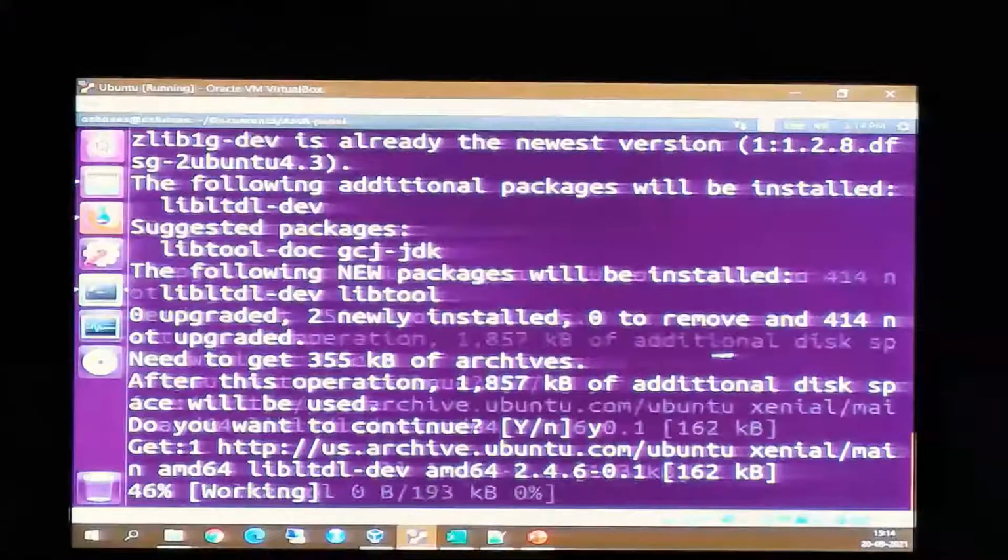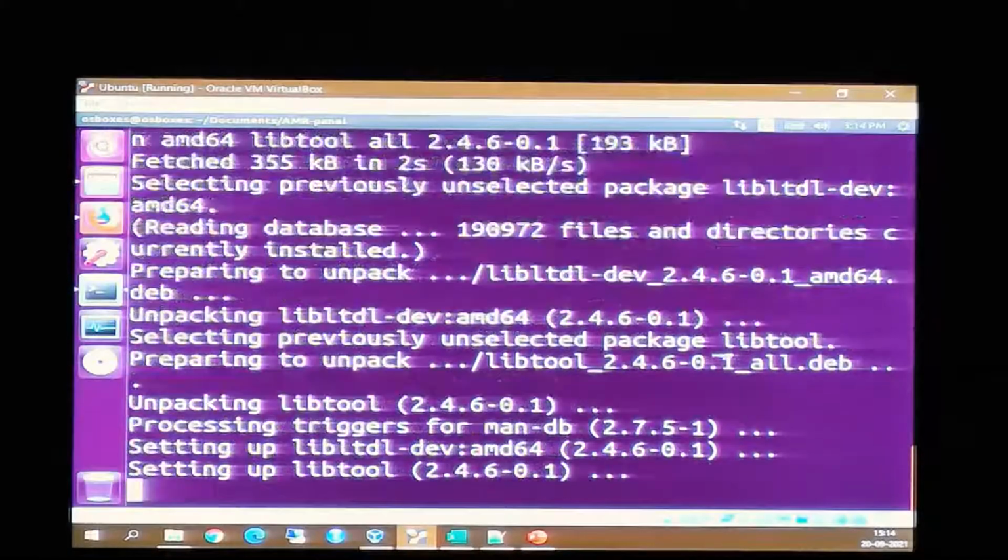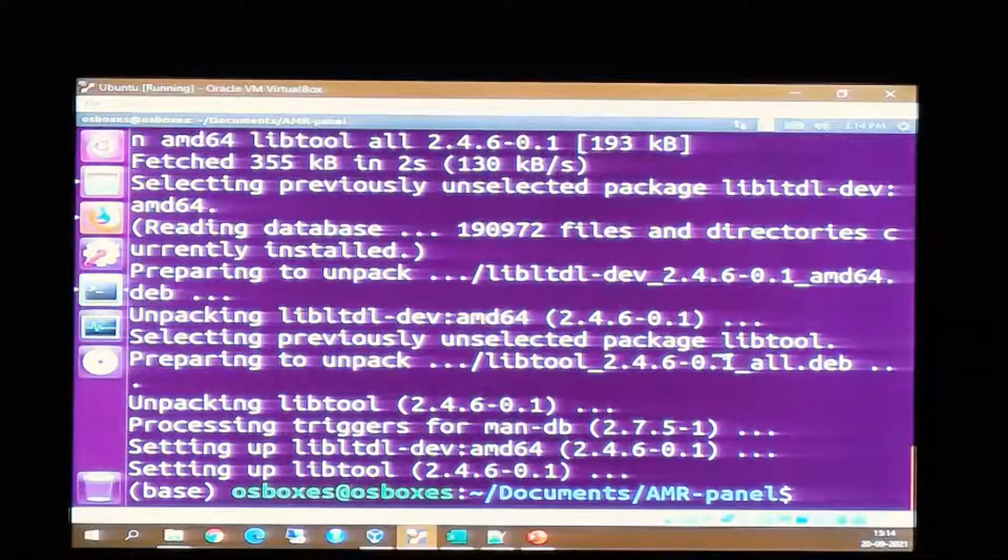So Y, press enter. Whatever software we have given, it has its own repository where all the setup files for those softwares are available. It will download the setup files and install them for you. Panda6, what is the process?